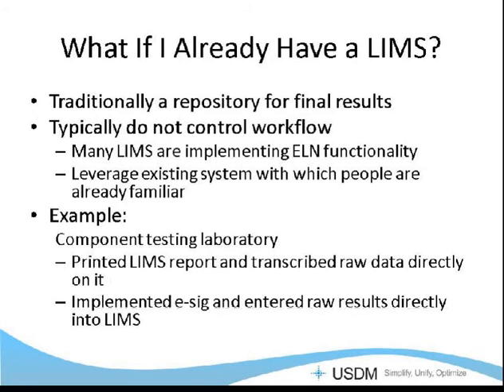So there's a lot of utility in having an electronic notebook in your lab. The question is, what if you already have a LIMS? I think while ELNs are relatively new in the analytical laboratories, LIMS has been around for as long as I've been around, and before that, it's a standard function in the labs.